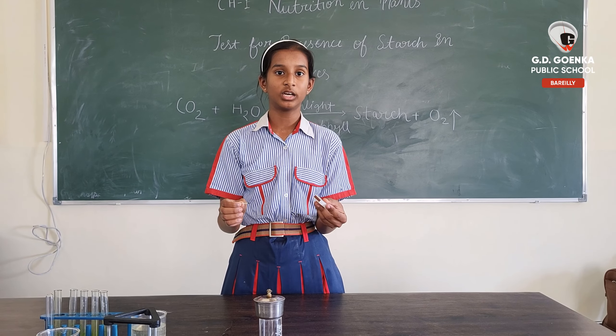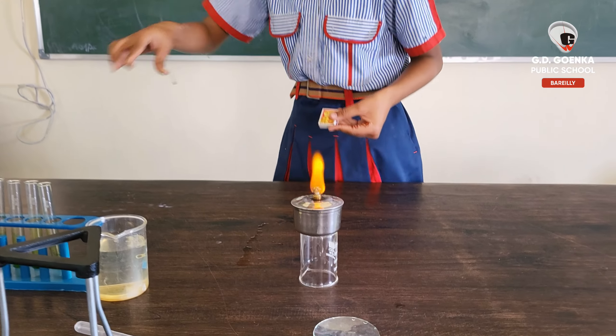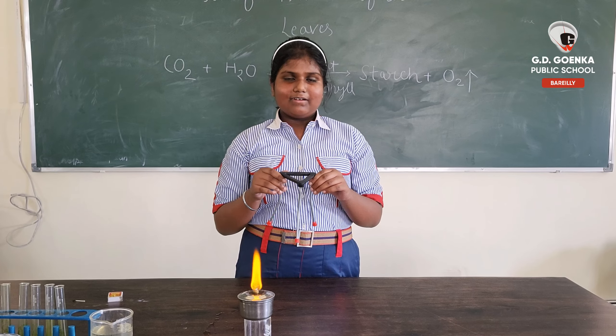First, we will light up our Bunsen burner. Then, we will place a tripod stand.